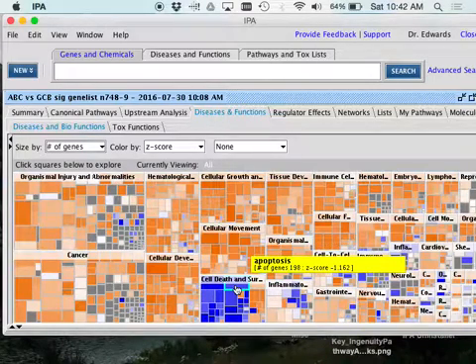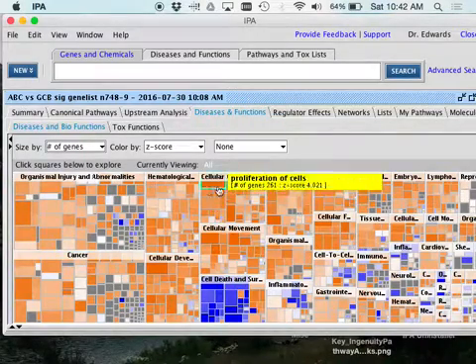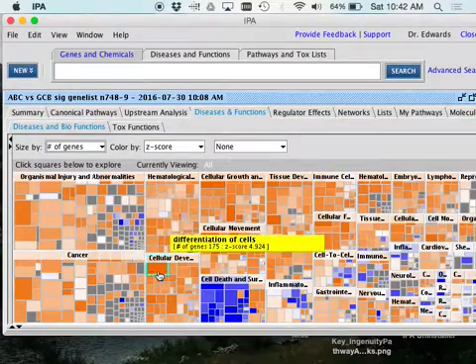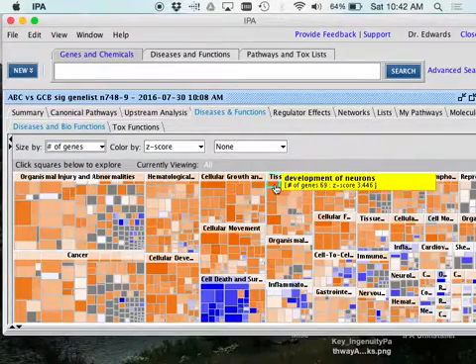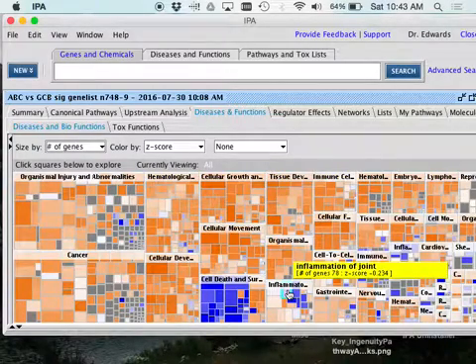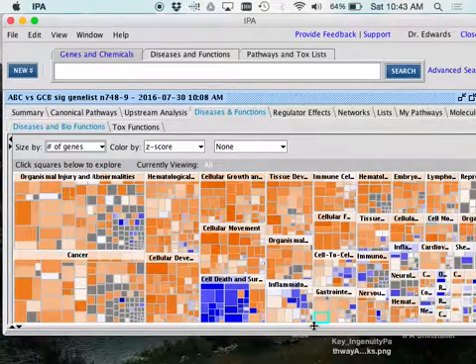What's the only thing going down pretty much? Cell death, right? Does that make sense? Does all this make sense? Totally, right? Growing, blood vessels, cellular development, your immune system is up. This makes sense, and this is what I typically see. So I don't usually spend a lot of time on this page. I mean, you can. It's kind of cool.